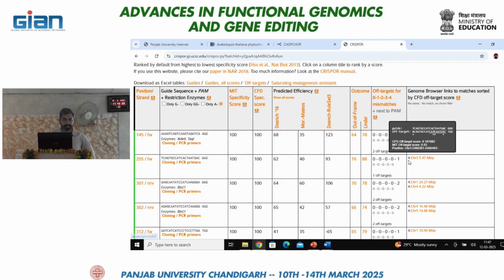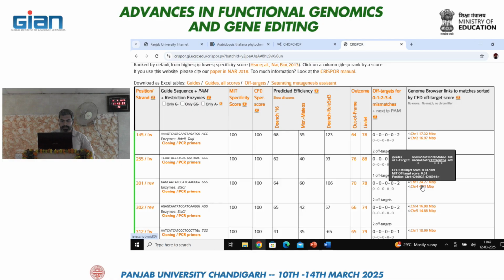And this gene lies in chromosome 3. I know this part. So here we have 2 off target sites, one in chromosome 1, and it's also giving the location as well.